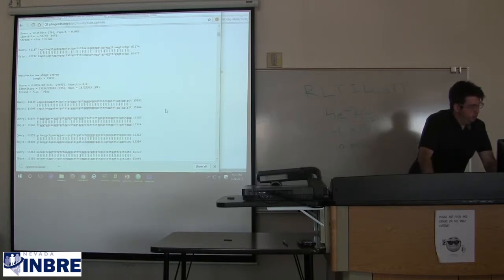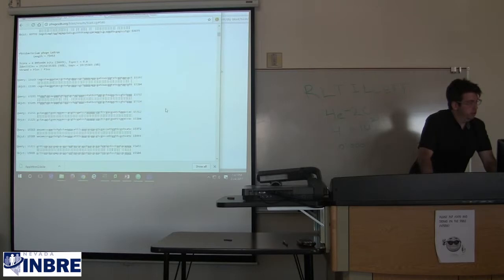And so, to focus on LeBron, we look here at the description of what LeBron is. LeBron is a very similar length, 73,453.